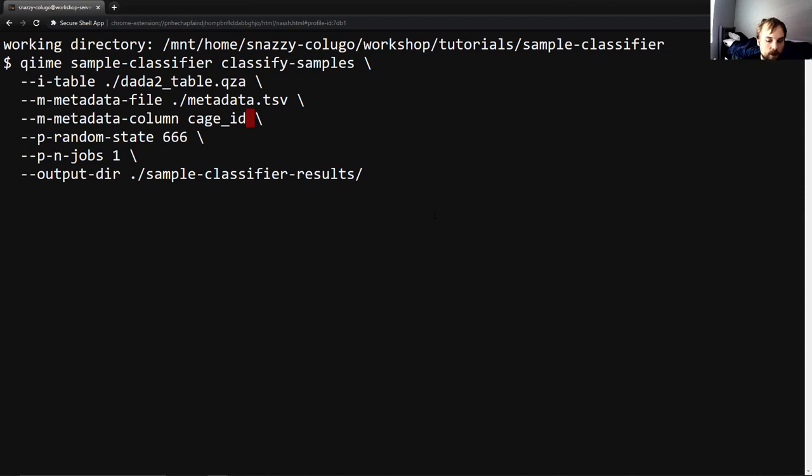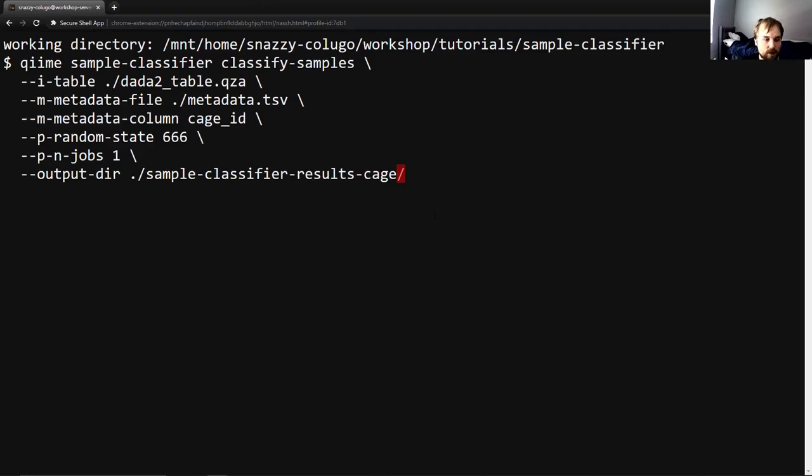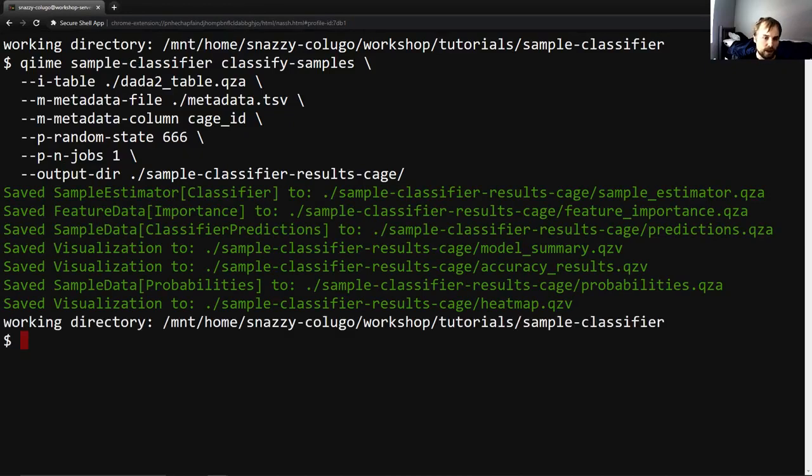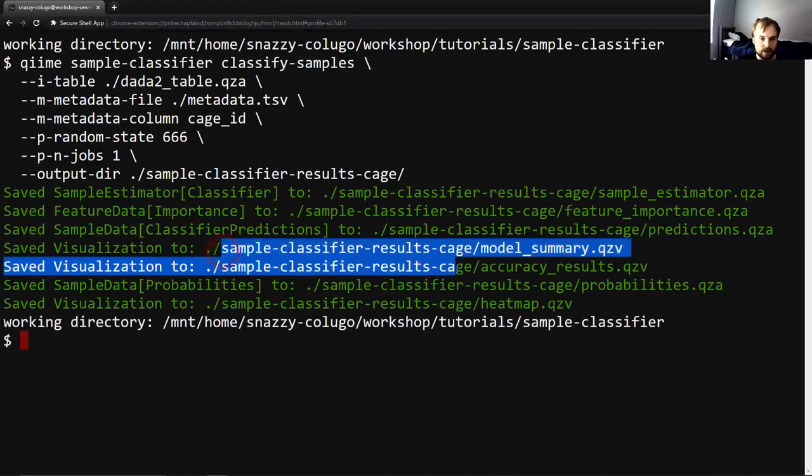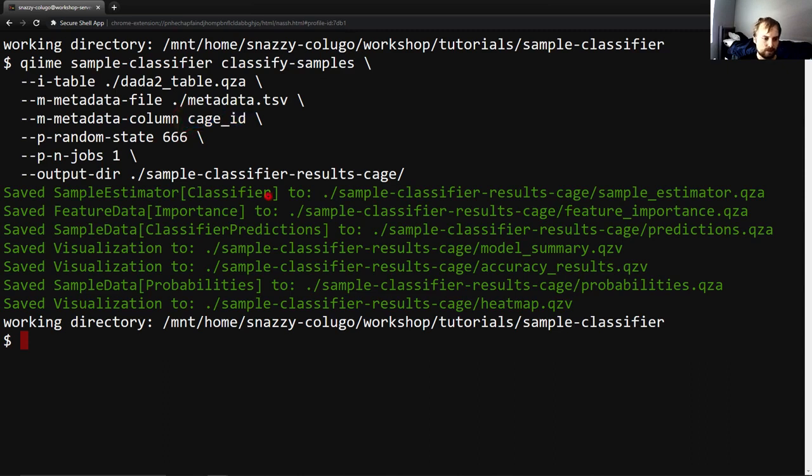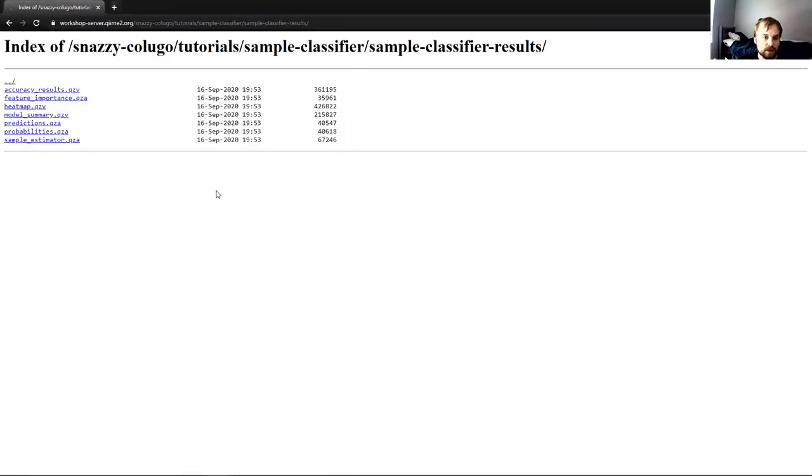So we will hit run on this, but first I'm actually going to change our output dir as well to sample classifier results cage so that we don't overwrite our previous results. And let's go. And this will generate those same seven outputs, the same four QZAs and the same three QZVs, but in sample classifier results cage. And instead of trying to predict the type and donor status of the samples, this is trying to predict the cage ID.